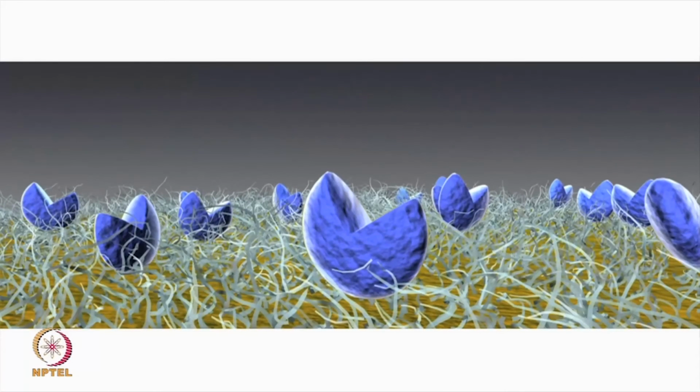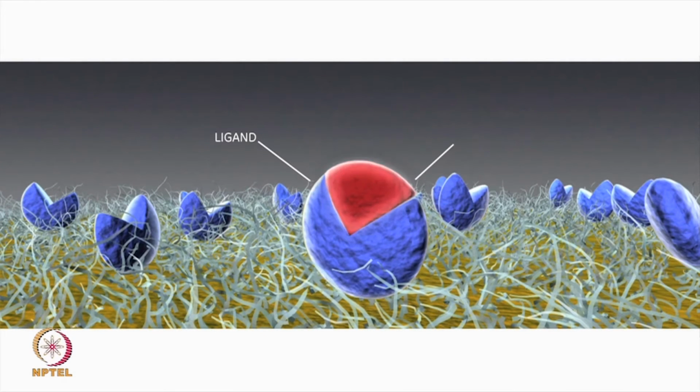The specificity of the surface is determined by the nature of the molecule attached to it. So one binding partner is attached to the surface of a sensor chip, and the other is injected in a continuous flow of solution. Whatever the nature of the molecules involved, we call the attached interacting partner the ligand, and the partner in solution the analyte.